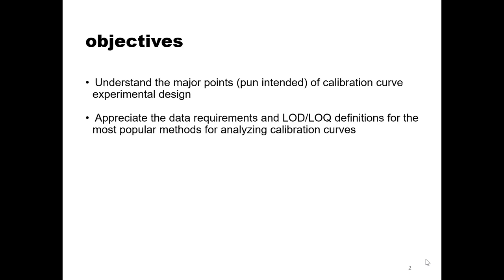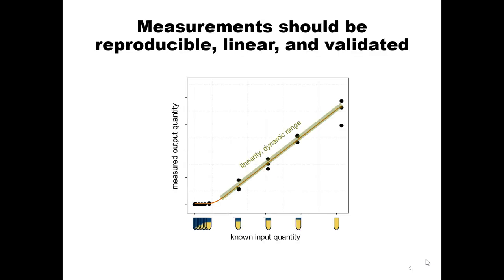Different analysis methods for calibration curves require different things from the data, and pretty much every single way to analyze a calibration curve has a slightly different statistical definition for what the LOD and the LOQ are. It's okay that there are so many different definitions, as long as you understand what your definition of LOD and LOQ is, and you are forthright with that in your write-ups.